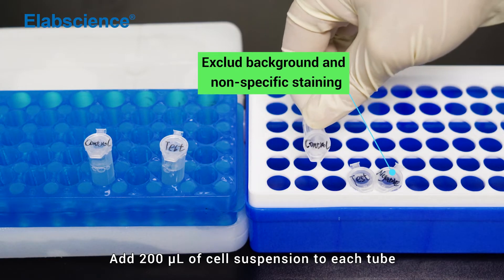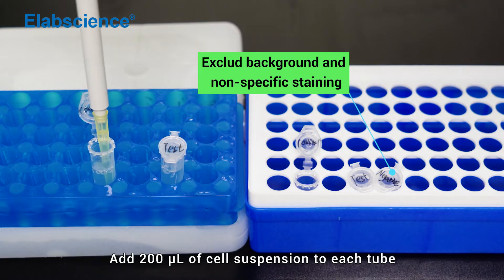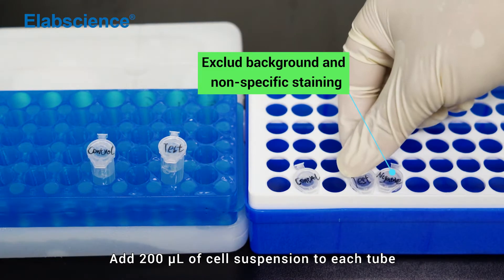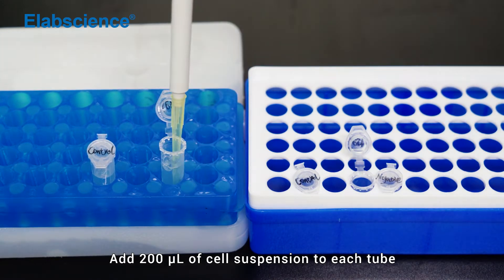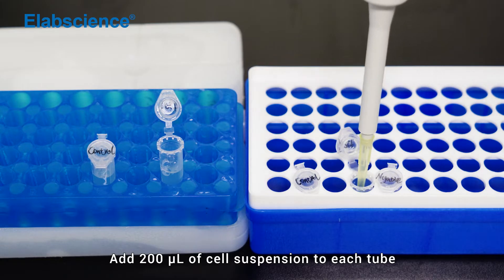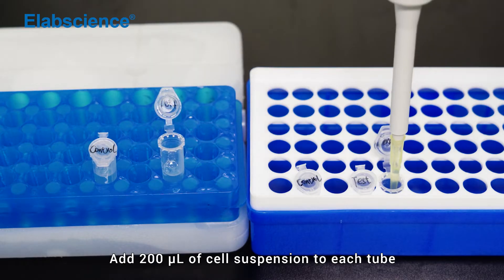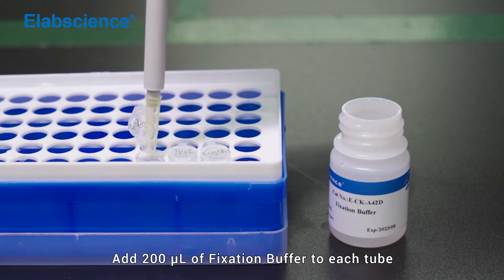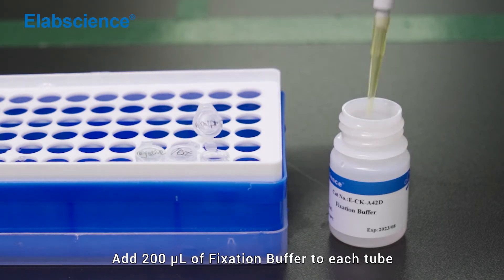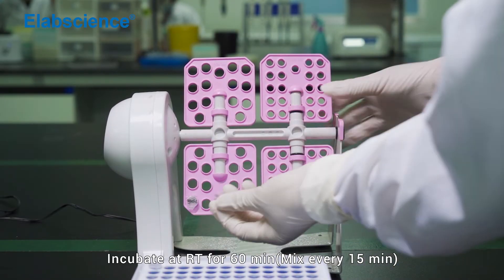Fixation and permeabilization: Add 200 µL of cell suspension to each tube. Add 200 µL of fixation buffer to each tube. Incubate at room temperature for 60 minutes.